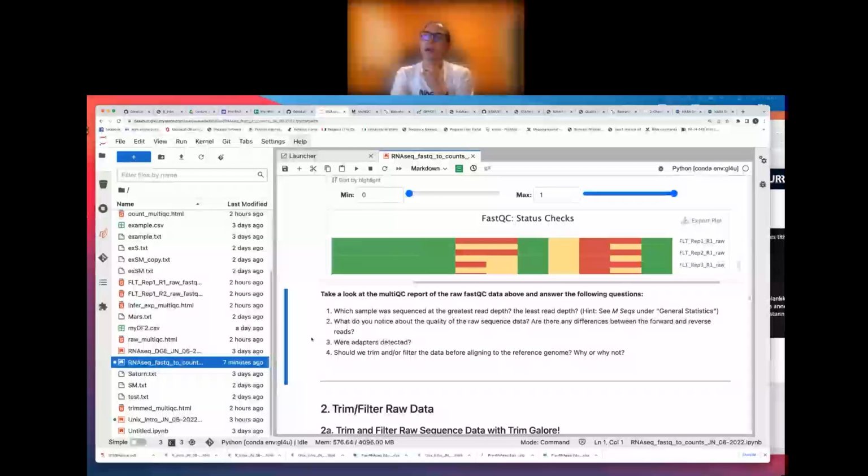Before, guys, I know we were doing the poll to ask questions in our intro notebooks. We wanted a functionality where everyone can see what answers people are putting down without their names attached, in case people don't want their names attached to the answers. So I am going to request that all of you answer. Take your time. If you feel really stumped, just put a guess in there, because I'm not going to show answers until everyone's done. If you're really stumped, just put a guess or put I don't know, and we'll go over it together. We're going to ask these questions one at a time.